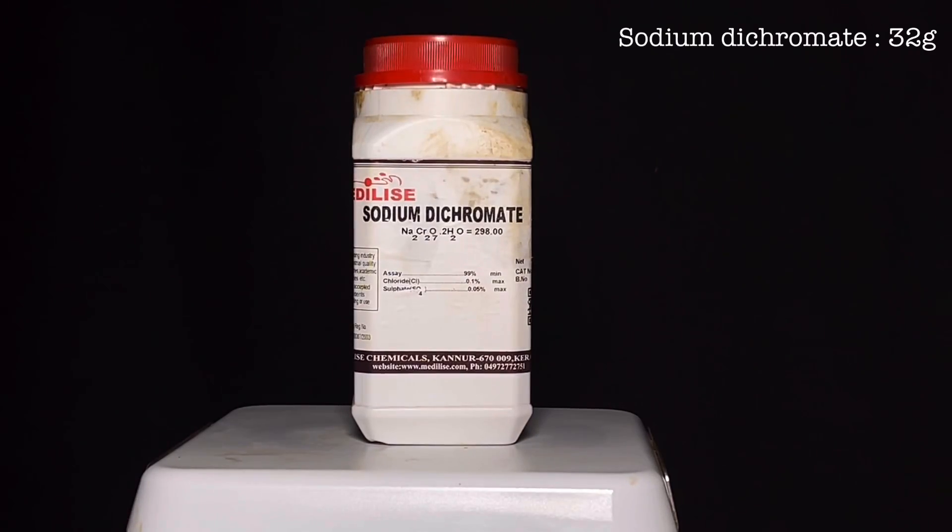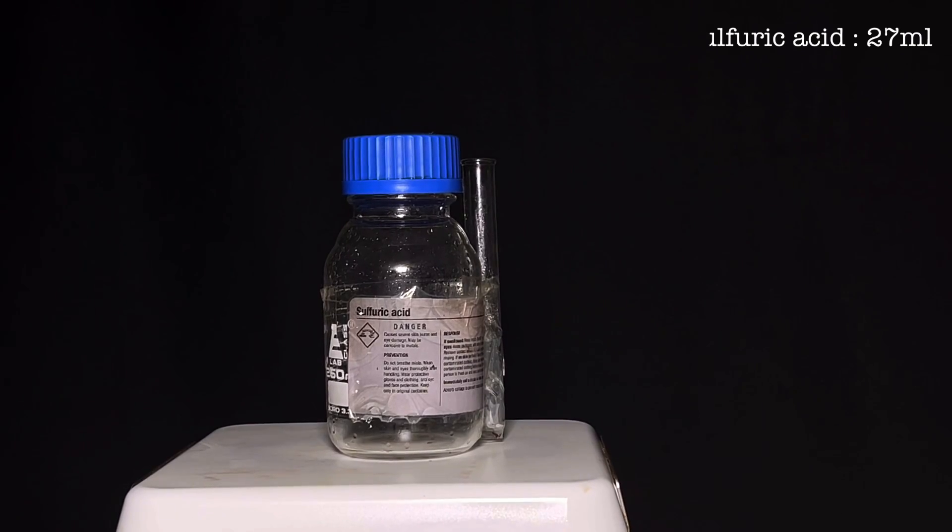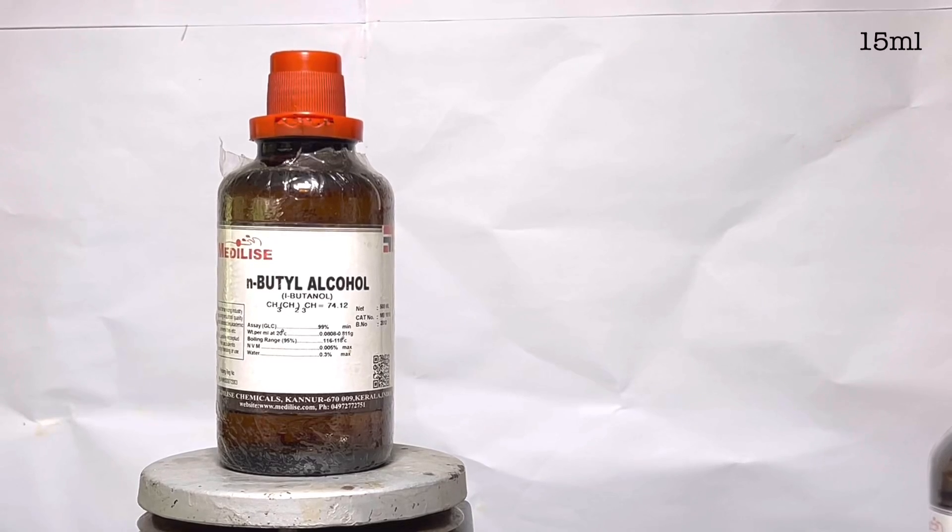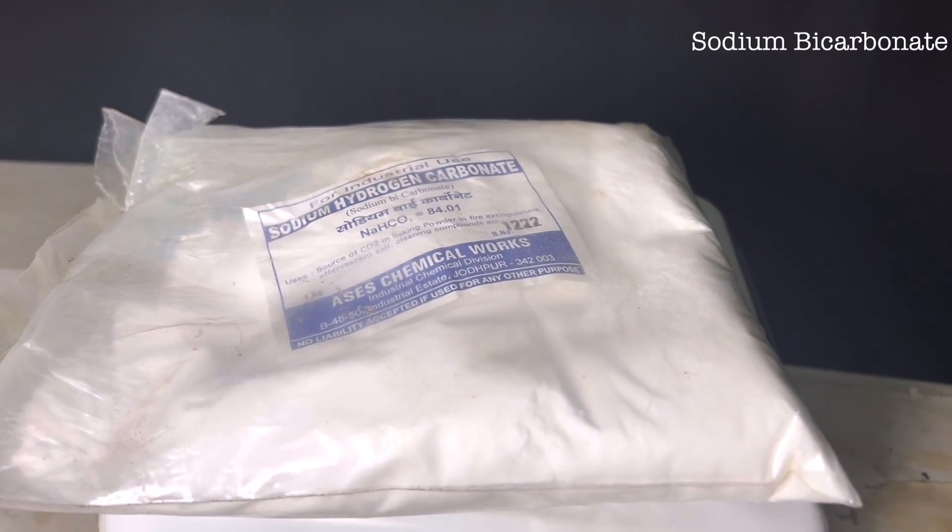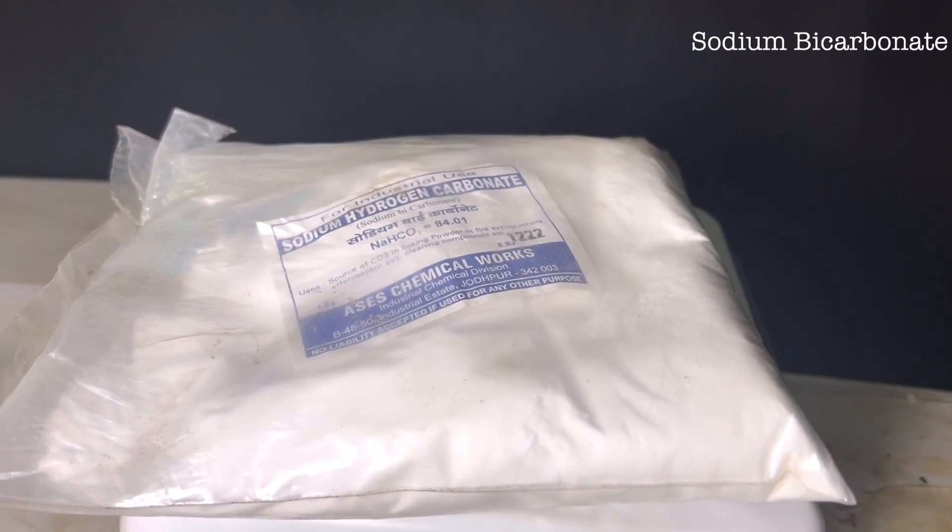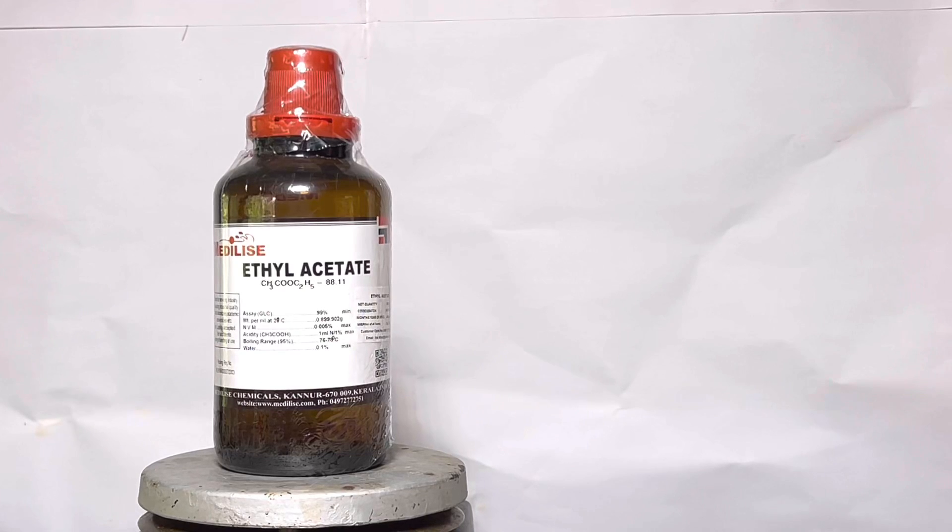For this experiment you will need 32 grams of sodium dichromate, 27 milliliters of 98% aged sulfuric acid, 15 milliliters of 1-butanol. For the purification and extraction part, we will need sodium bicarbonate, 50% aged sulfuric acid and ethyl acetate solvent.